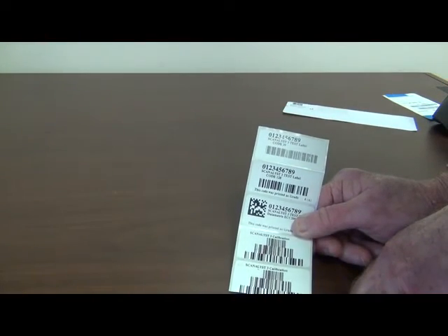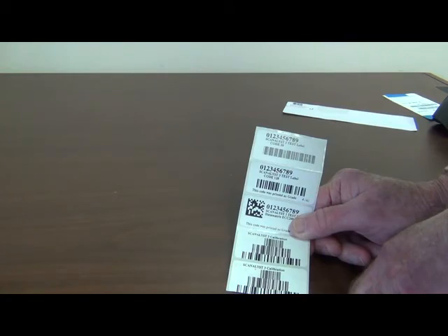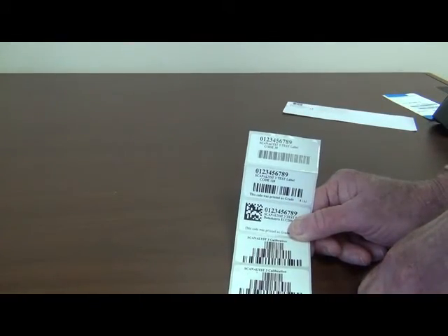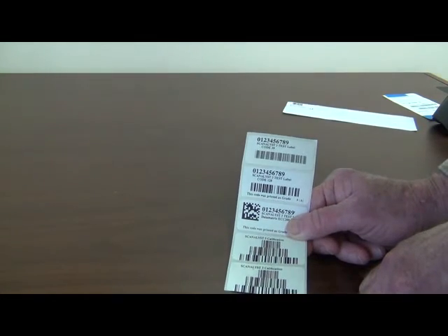Also, barcode height, the height of the bars themselves. If you have laser scanners being used, then the laser beam has to be angled at the same orientation as the barcode itself. So very short barcodes are more difficult for a laser user to zero in on.